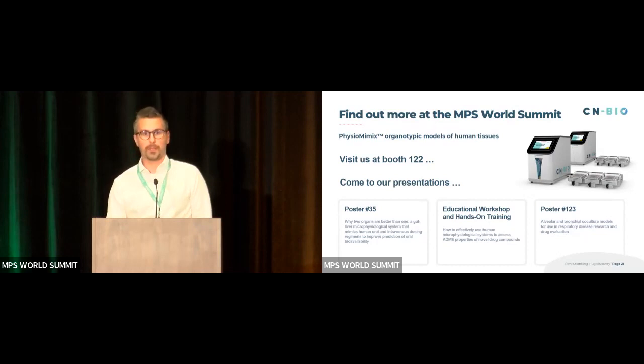I think we really want to be able to build all sorts of MPS using iPS-derived cells, but their functionality is still not the same level as primary human cells. So the focus for building MPS at this point has got to be on those primary cells. And whilst we work with the iPS community closely, because iPS-derived cells in these type of systems do function much better, they don't suddenly become fully mature just because you put them in MPS. Okay, thank you.